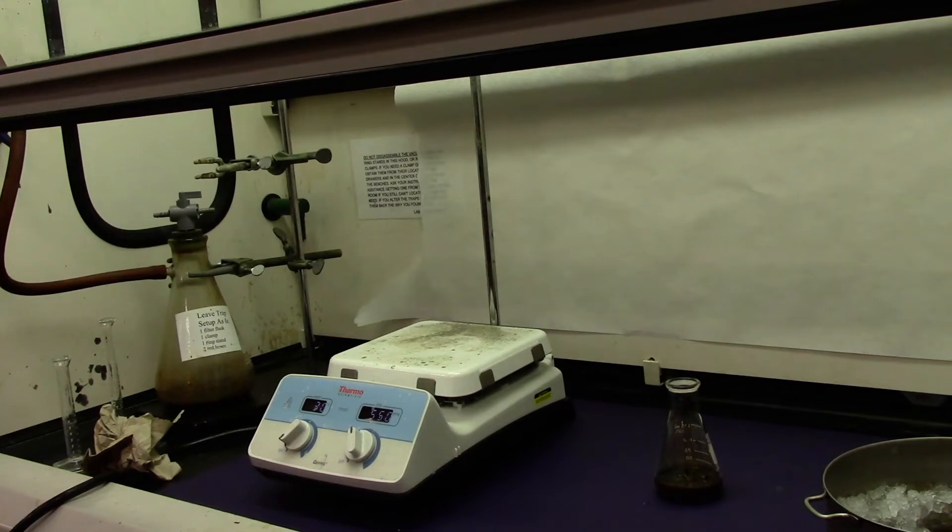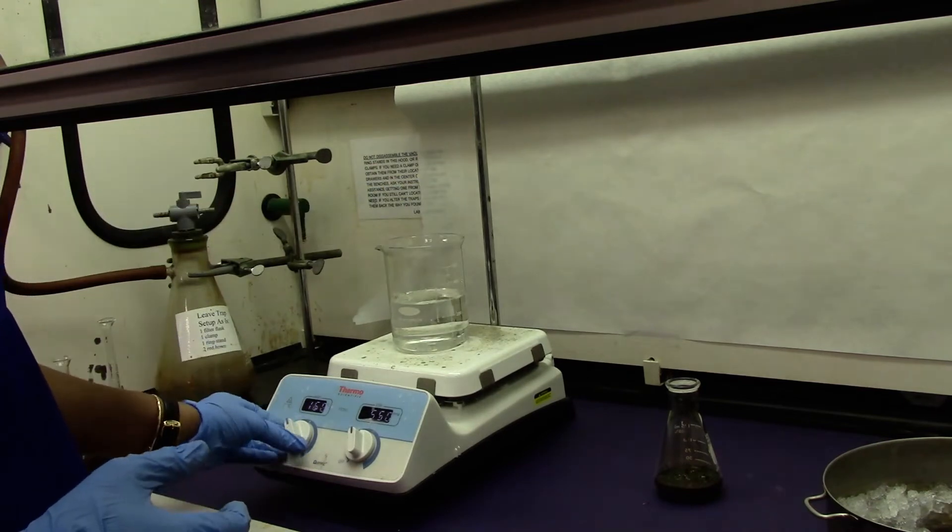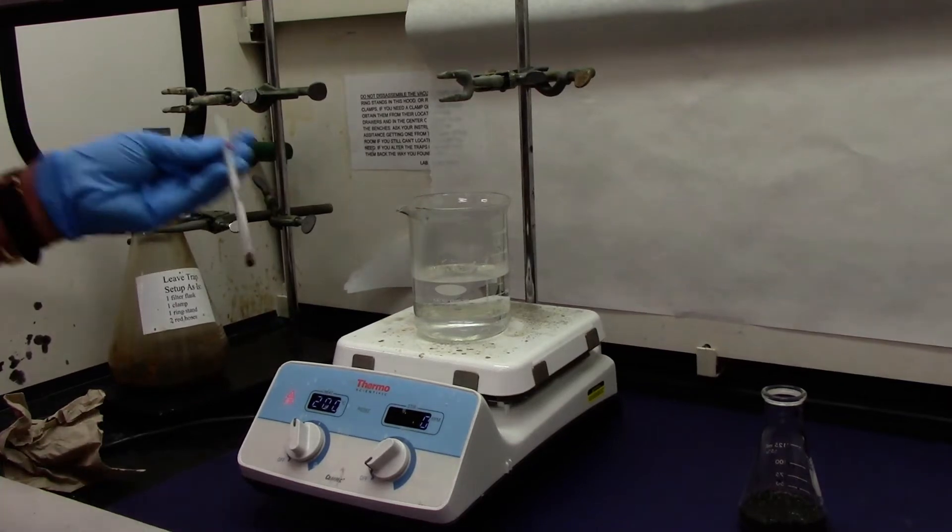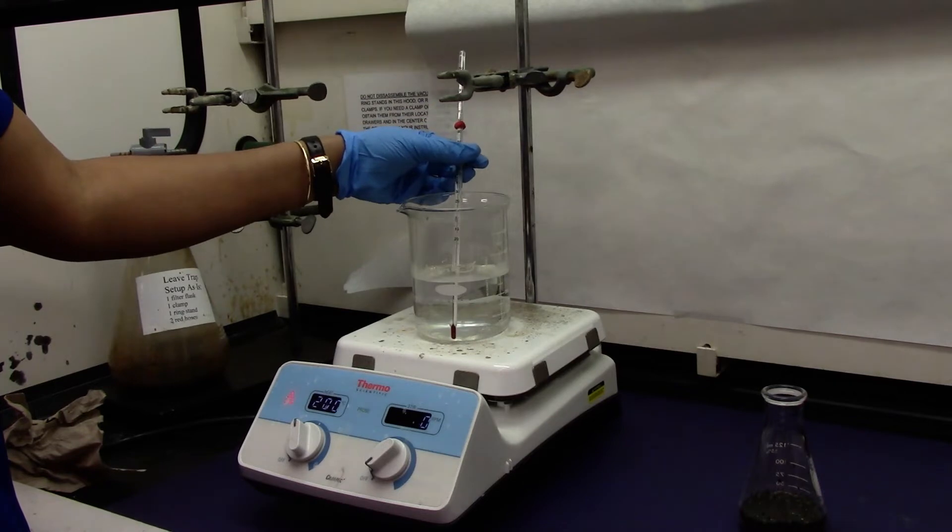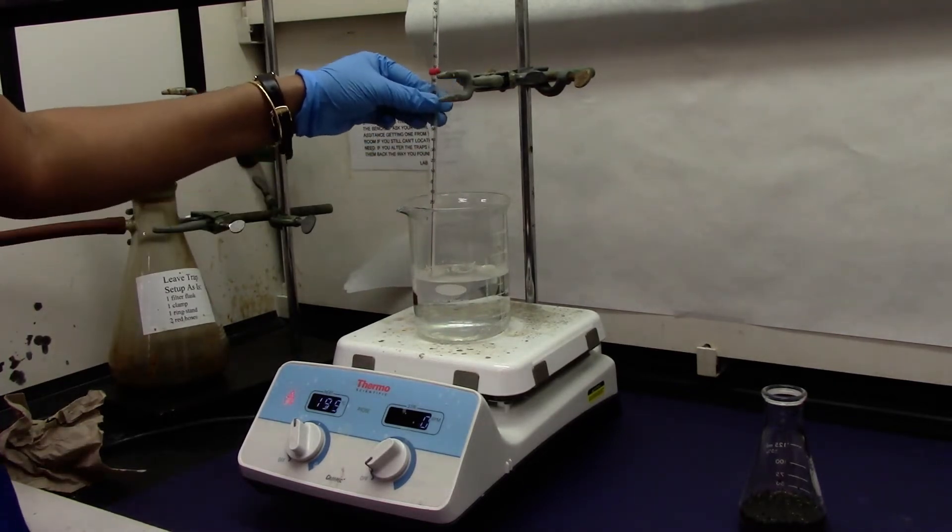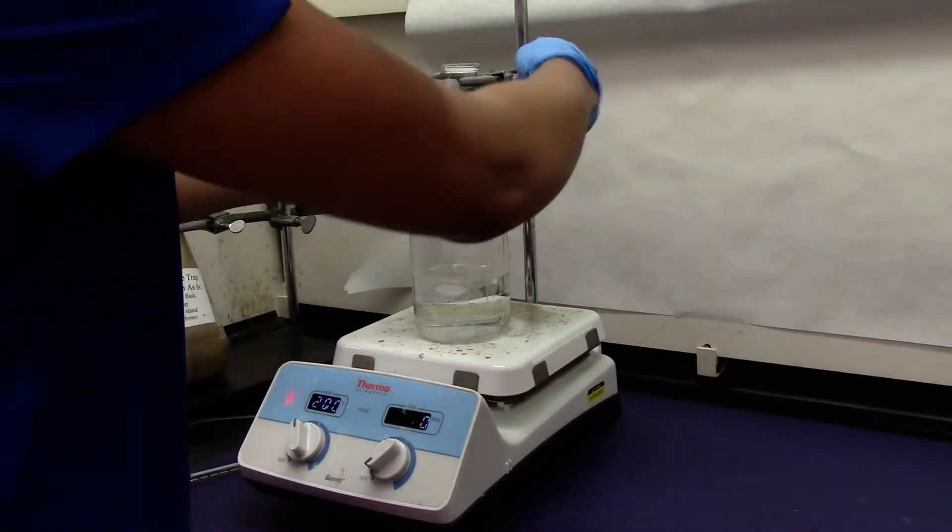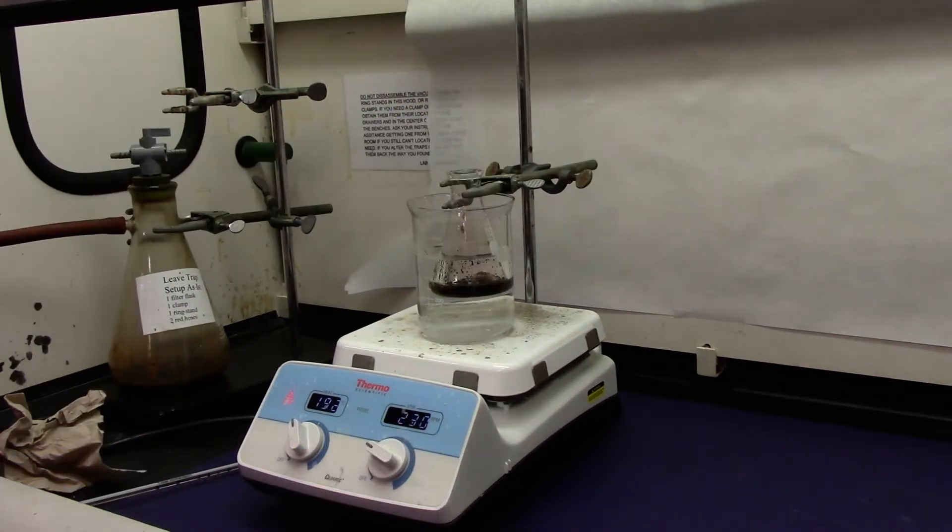While the mixture is standing I'm going to go ahead and place a water bath to warm up. And add a clamp. While the water bath warms up you can check the temperature. We need around 40 degrees Celsius. So the temperature of the water bath is around 40 degrees. I'm going to go ahead and clamp my solution mixture. Slowly lower it down. So at 40 degrees Celsius we will let the mixture stir for about 10 minutes.